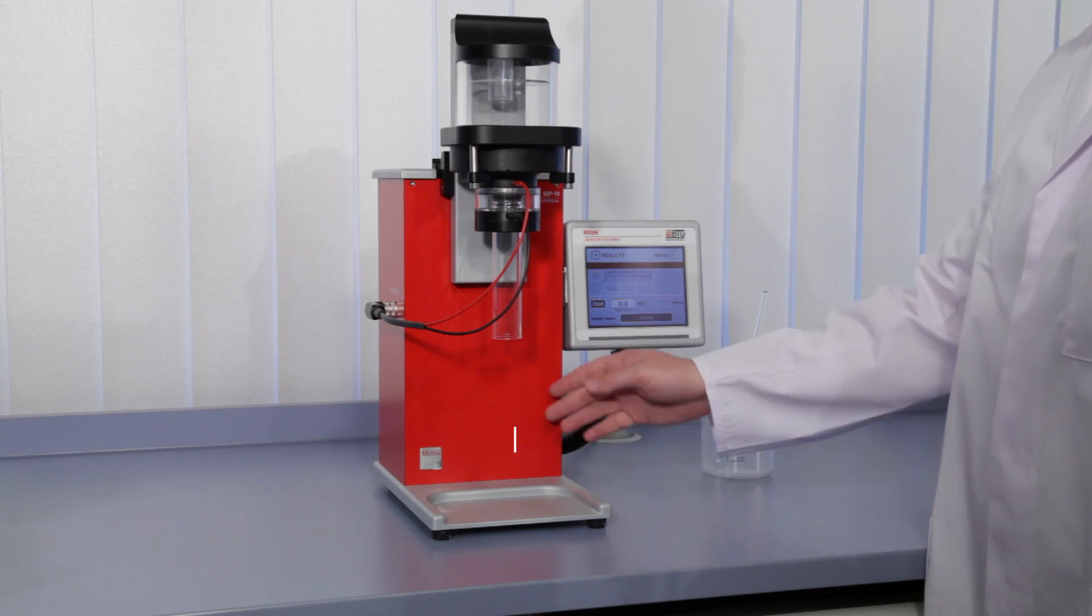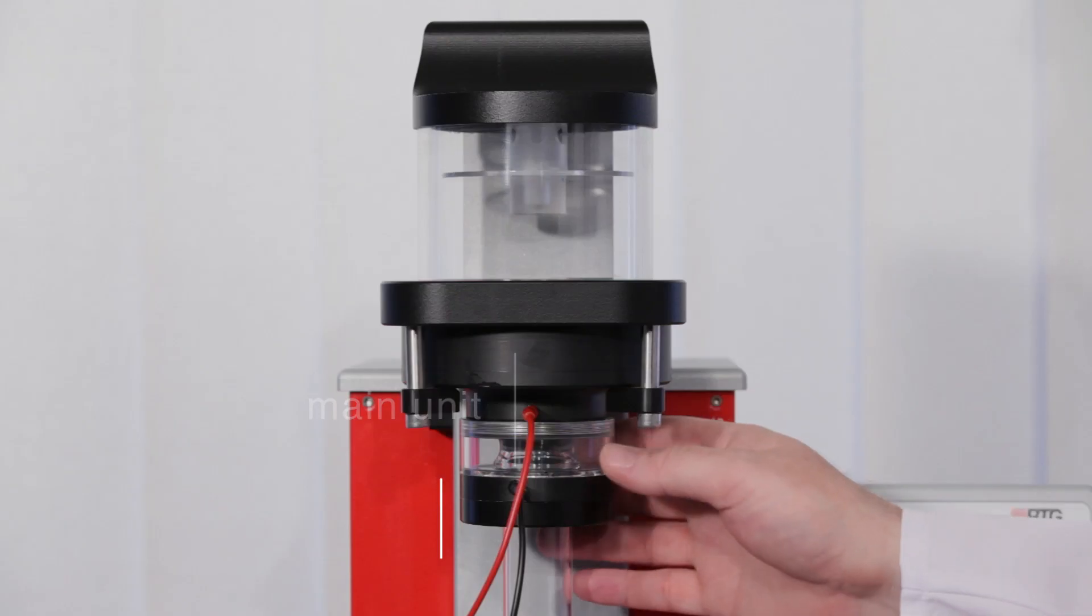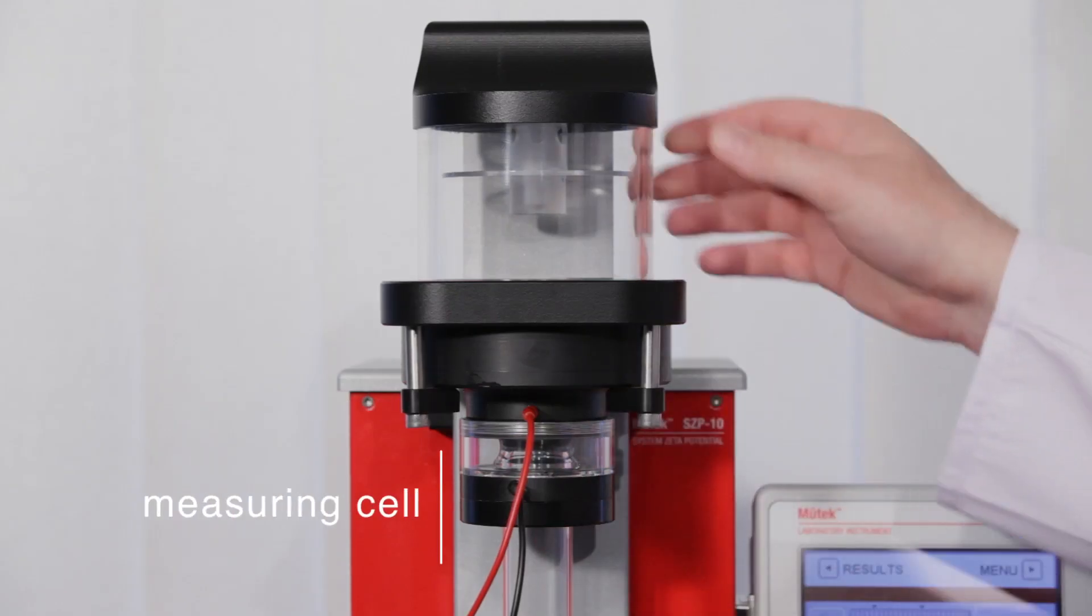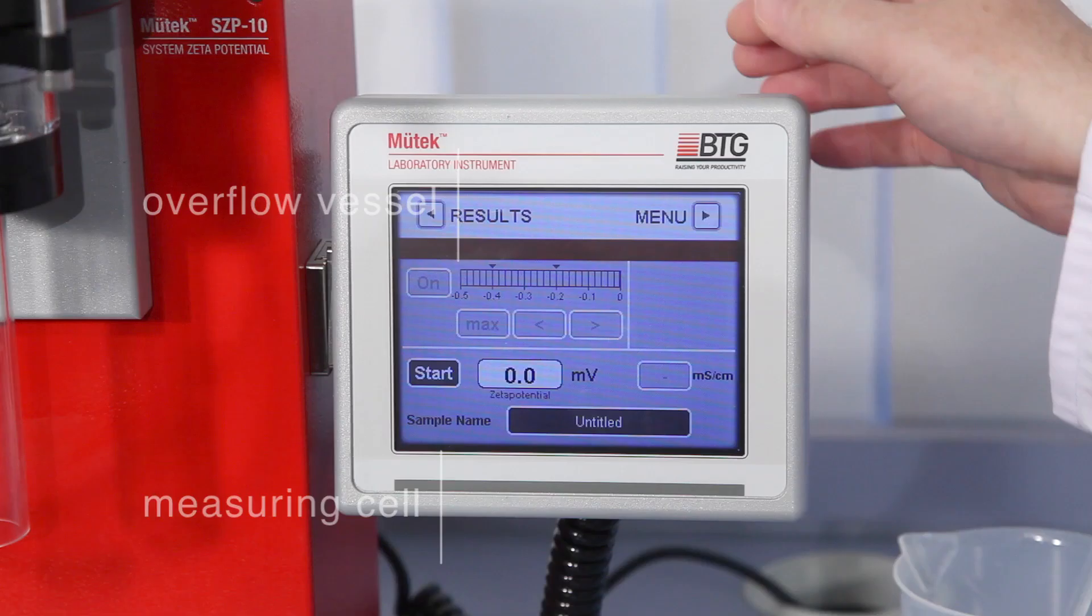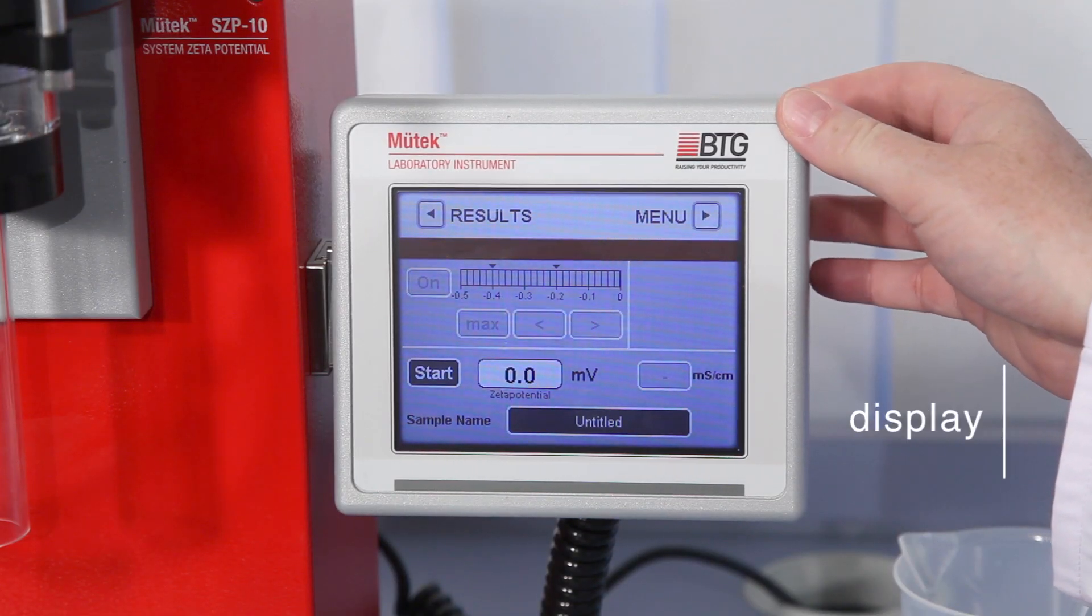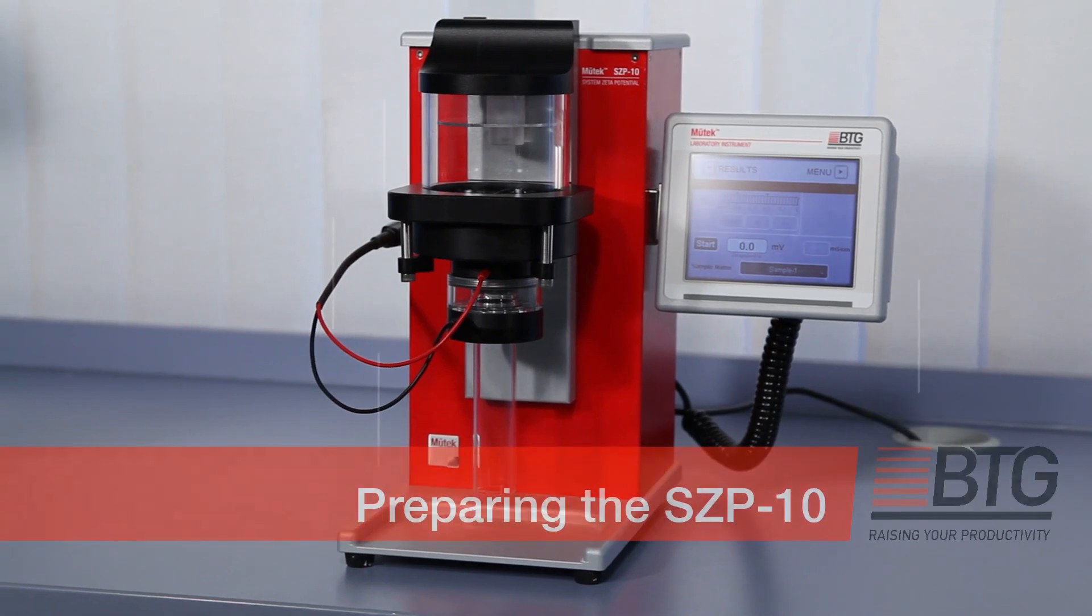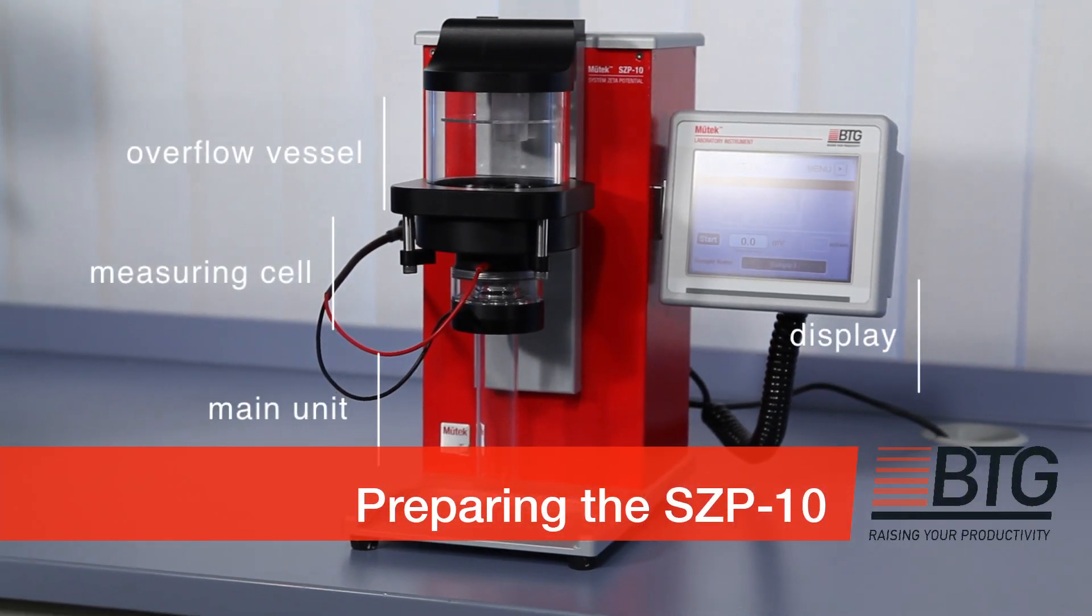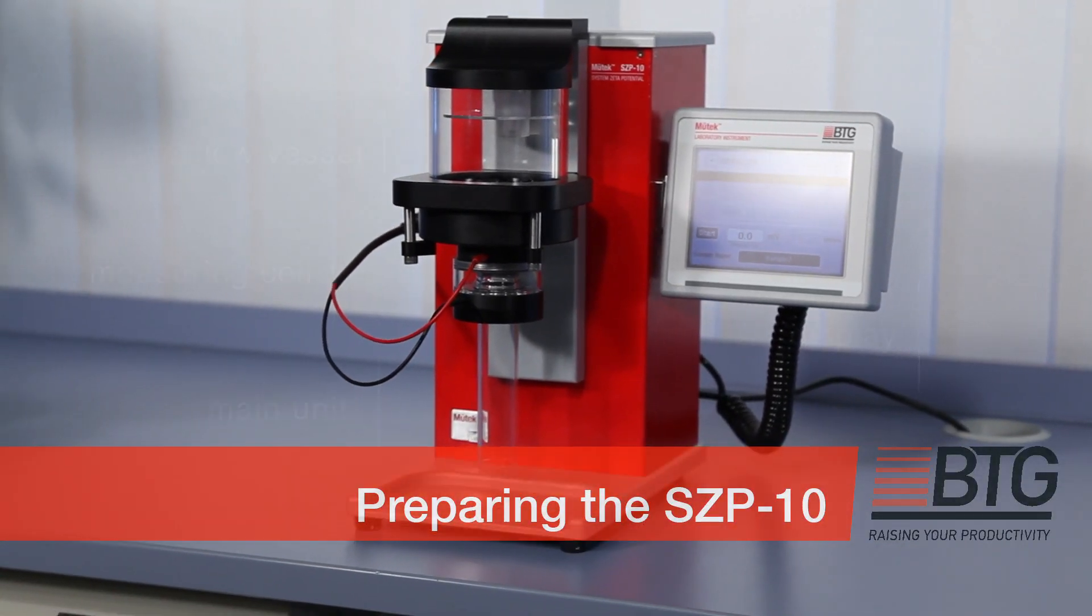The SZP consists of a main unit, the measuring cell which is attached to an overflow vessel, and a touch panel display to operate the instrument. Let's have a look and see how this instrument is used and how it works.